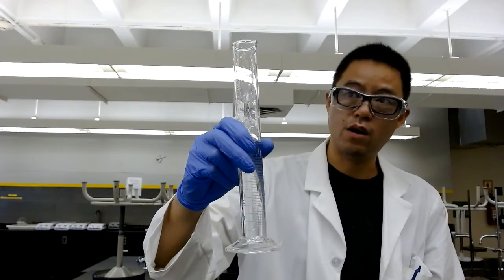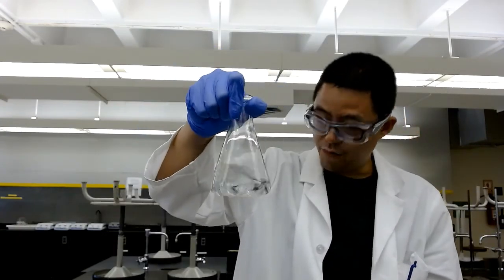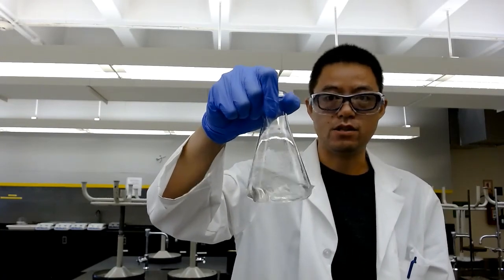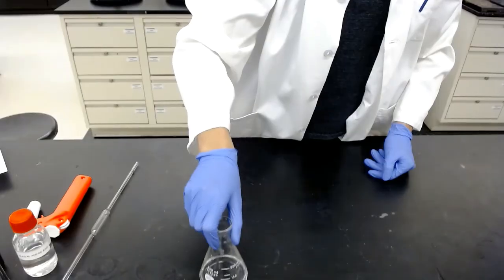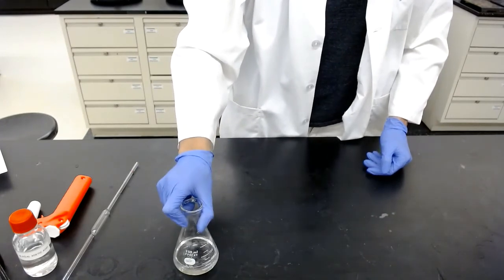And then I need 59 ml of water. I'm using a 100 ml graduated cylinder to obtain that much water. So now mixing them together, and then I'll finish step 1, the acetic acid stock solution. I'm going to leave this on the bench. Here's the stock solution, ready for step number 2.